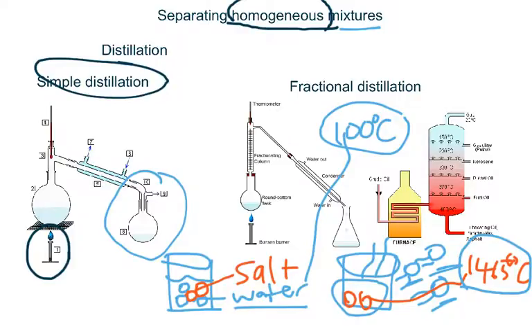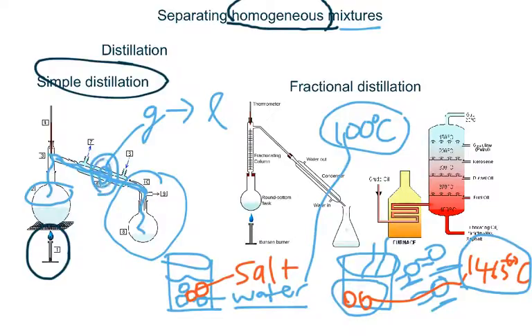So what happens is that these little blue molecules are probably water molecules that are in its gaseous form, and what they're doing is that they're going here, and then they're going to flow down this tube, and then they're going to drop down here. And while they're here, they're going to go from a gas to a liquid. Now, why is that? Well, this tube over here, this tube where I showed the path of the water vapor traveling, actually has something surrounding it. There's this kind of layer made of glass surrounding it that has water flowing around it.